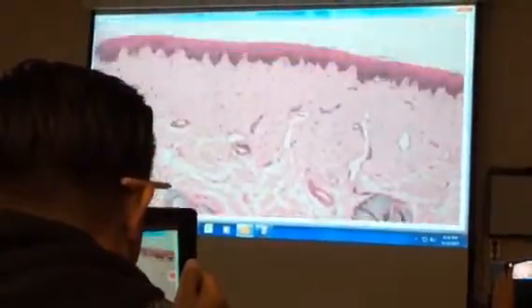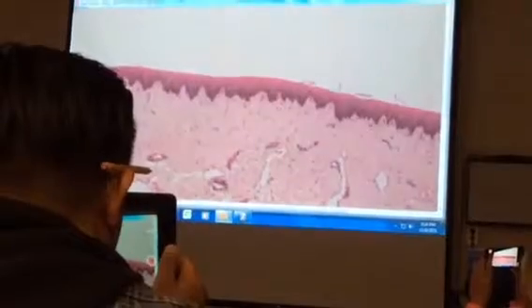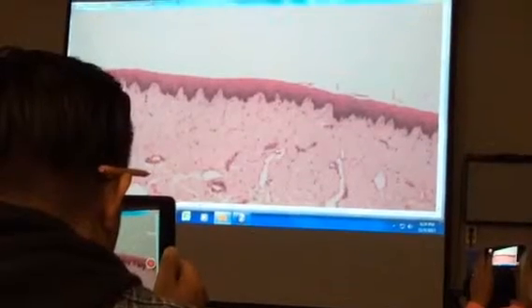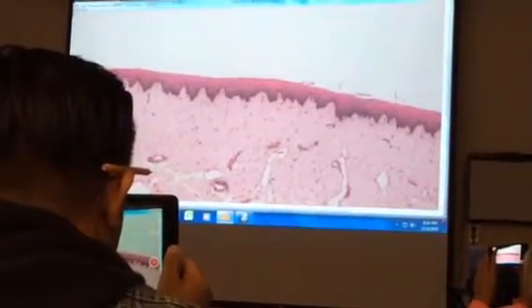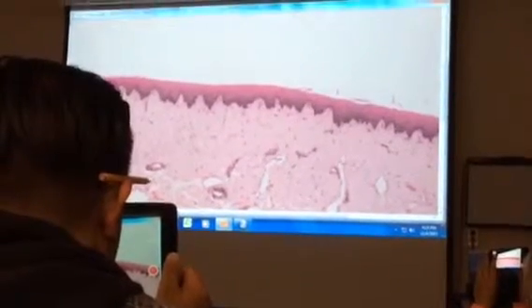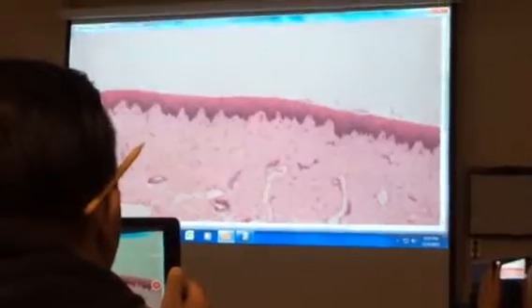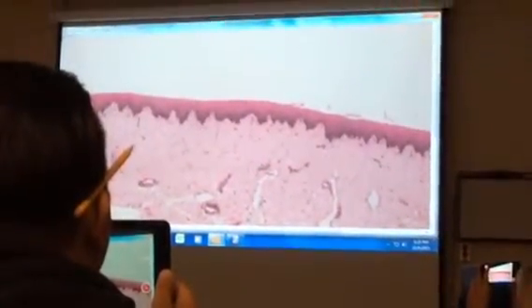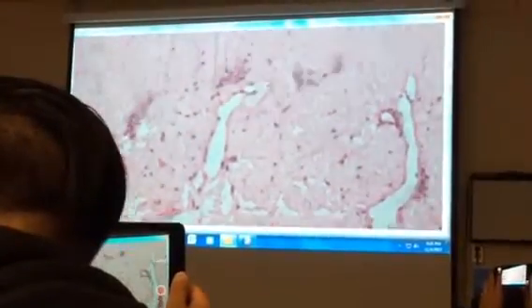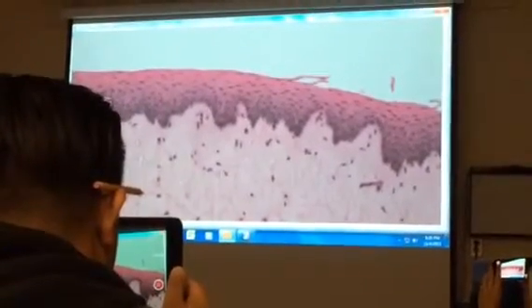Okay, so let's see what else we need to do here. So we got the main layers. We saw the epithelium. We said there's no muscularis mucosae in this. Lamina propria would be the name for this underlying part. And all that. Okay, there's no circular versus longitudinal muscle layer because it's got the skeletal muscle, it's a little different. And we got the esophageal glands, and we got the adventitia. Did I forget anything? I think that's it. So let's just look at the epithelia a little closer, and we'll look at the esophageal glands a little closer.